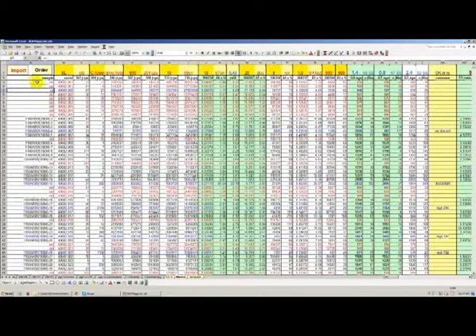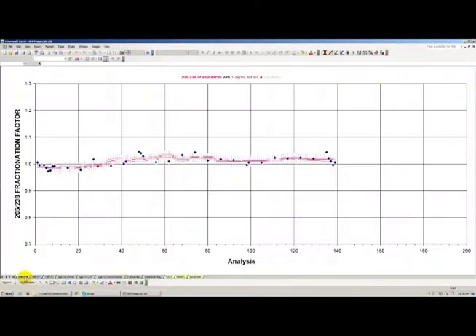If you count from number 3, then plus 28 is going to be cell number 30. So if you go down here to cell number 30, in fact, this is the other one that has an anomalously young age, and again, lowercase x. You hit enter, and that one turns blue again. And if you go to the 6-8 tab, you'll see that those standards are not in there anymore. And then our 2 sigma uncertainty envelope on that mean systematic fractionation factor.